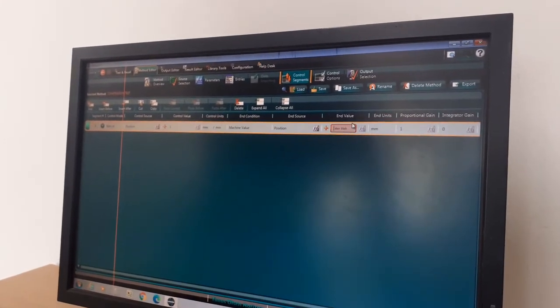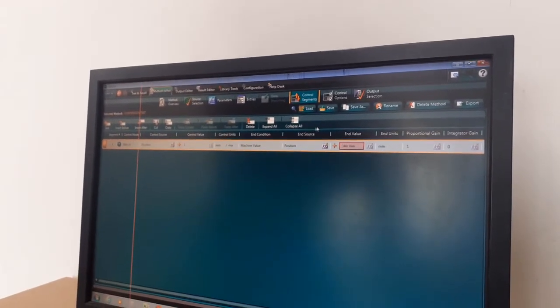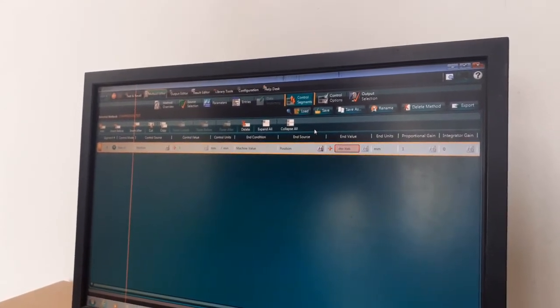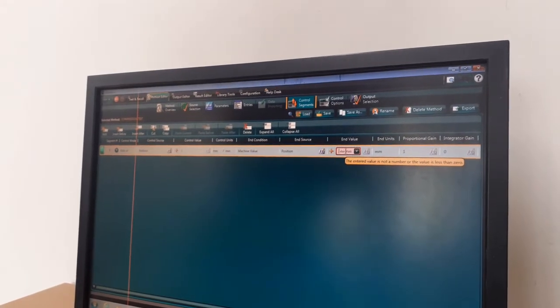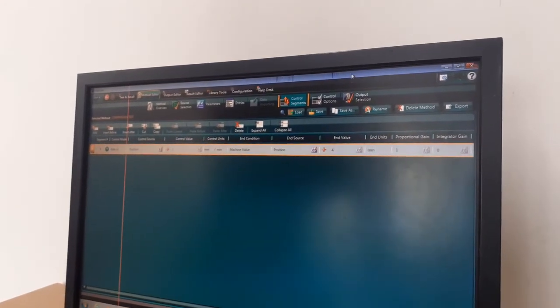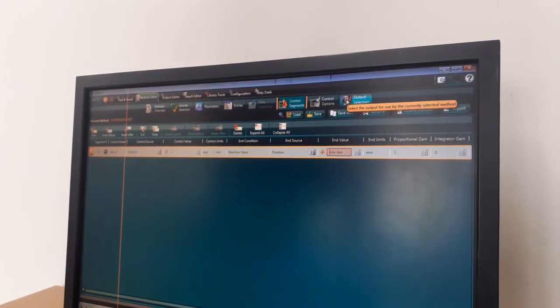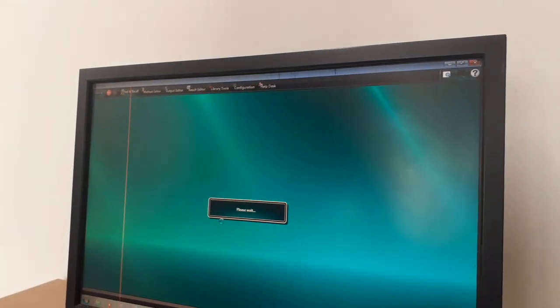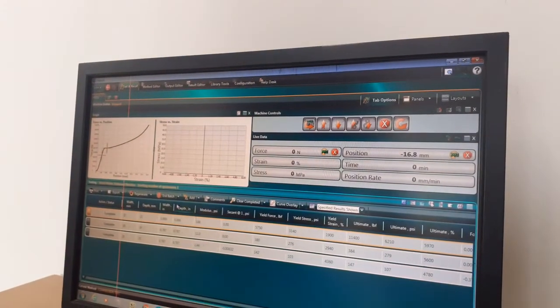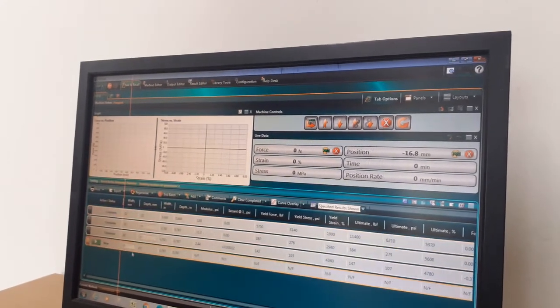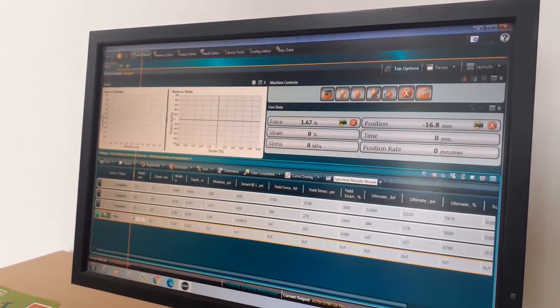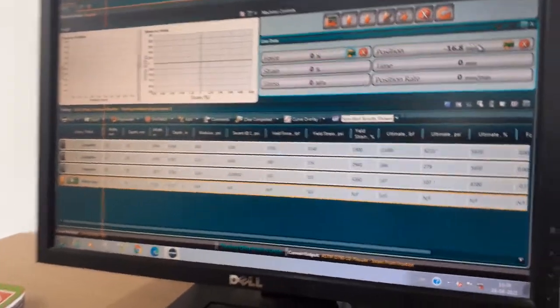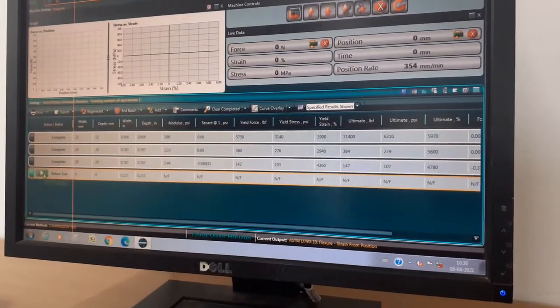The machine is not taking the specimen break as an end condition for the compression test, so we use the end condition as the machine value of approximately 4 mm. Now we start the test.